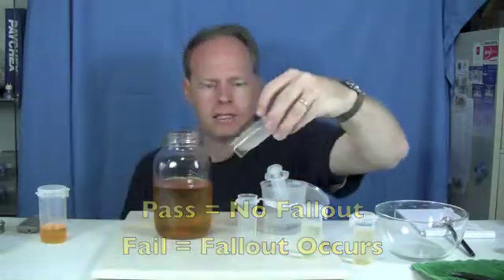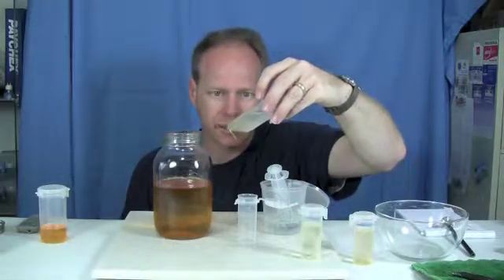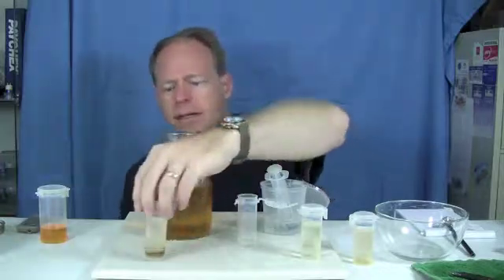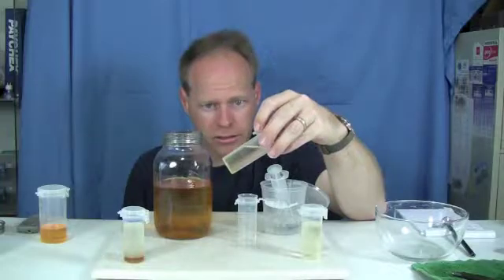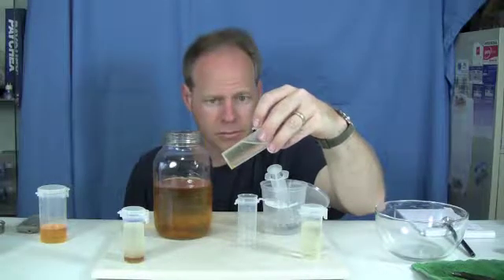This is an example of taking just plain oil and putting it in — you can see we have all three milliliters settling out. Then we have an example here of a batch that didn't quite react all the way and there's some puddling down on the bottom as well.